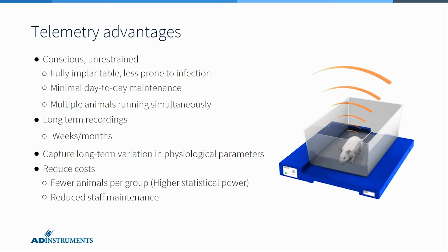What telemetry offers you is the ability to perform conscious, unrestrained physiological data collection from your research animals. Telemeters are fully implantable, so they're less prone to infection. After a short surgical procedure, the animals recover to behave normally, unencumbered by the telemetry device.